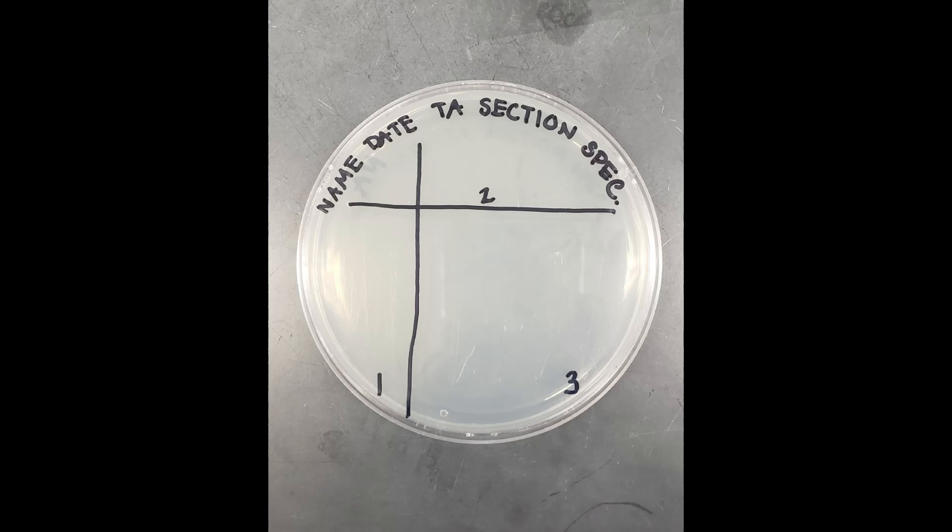Hello everyone! In this video, you will be learning how to obtain pure isolated colonies using the three-zone streaking method.